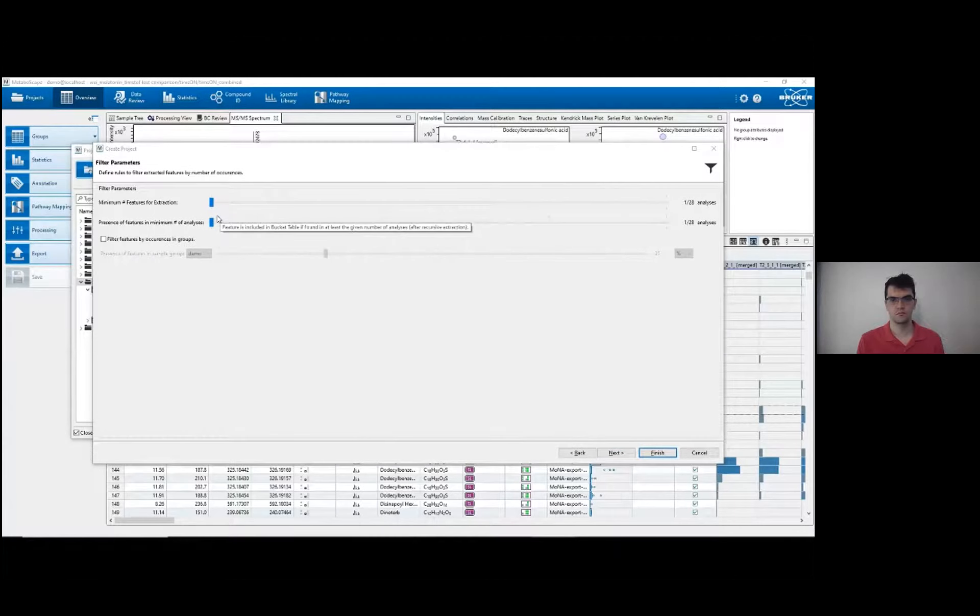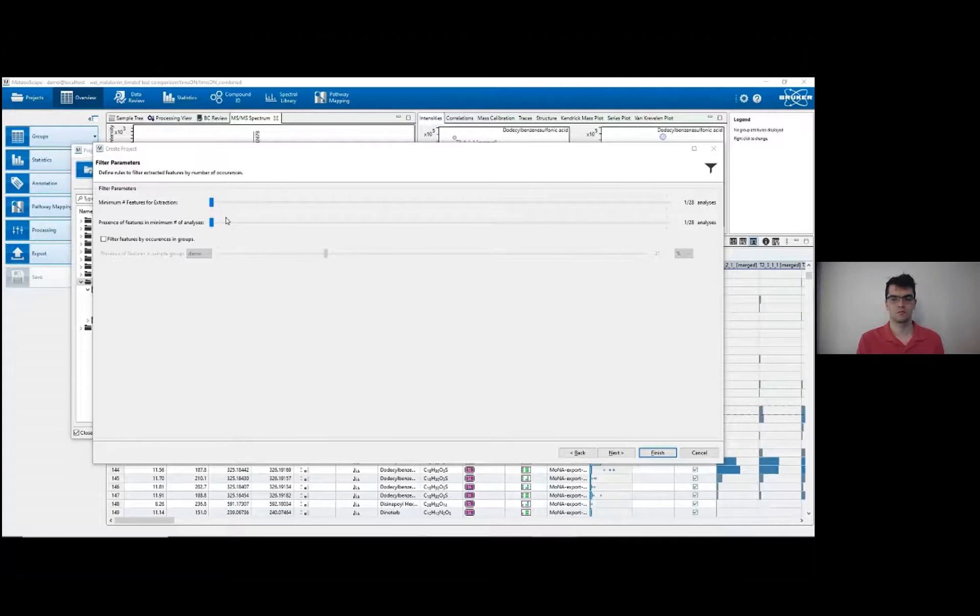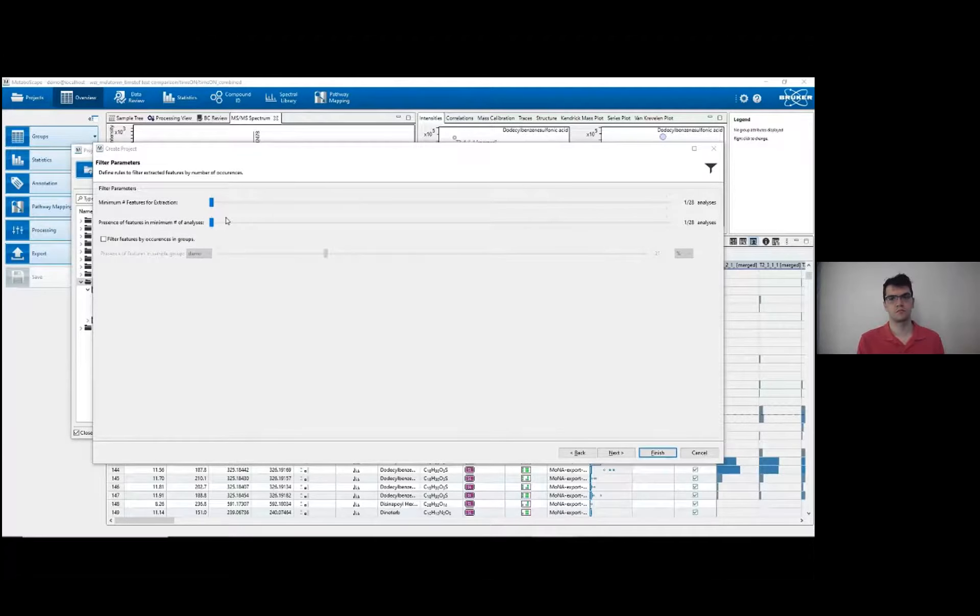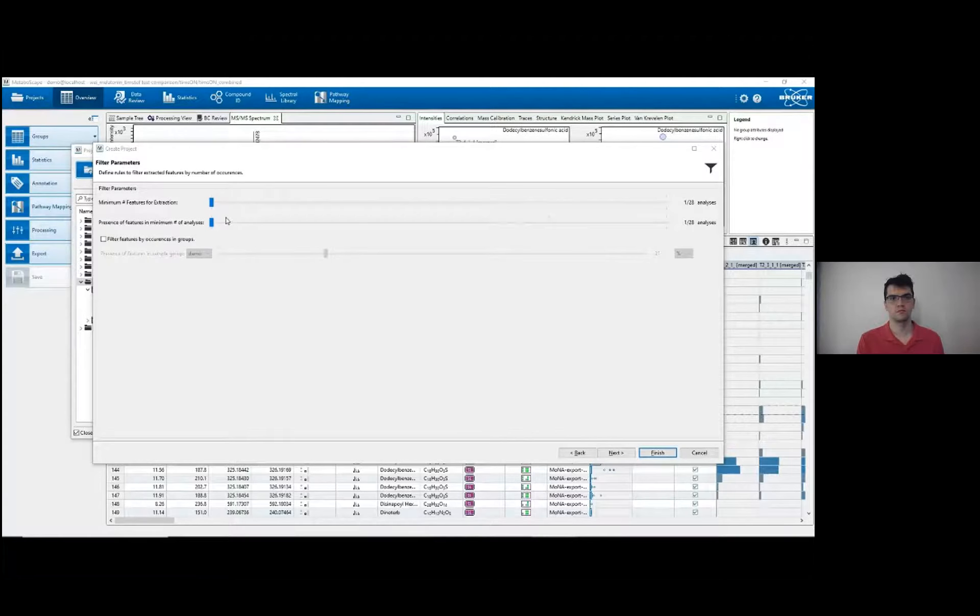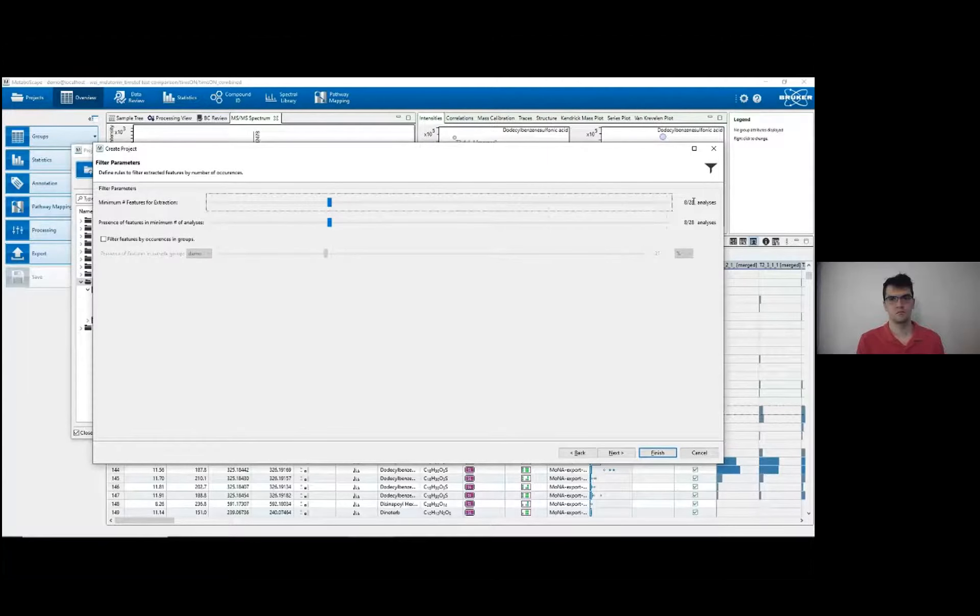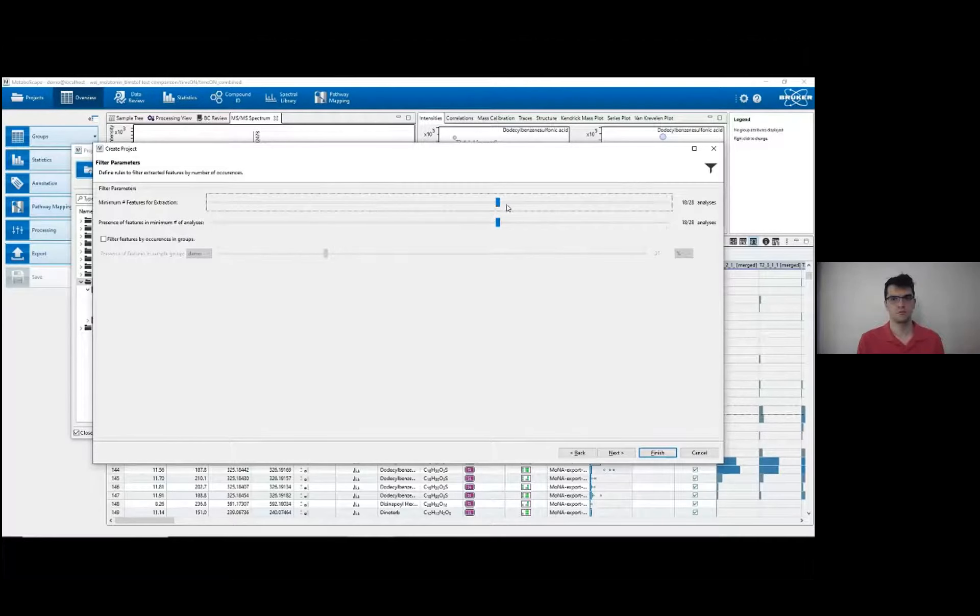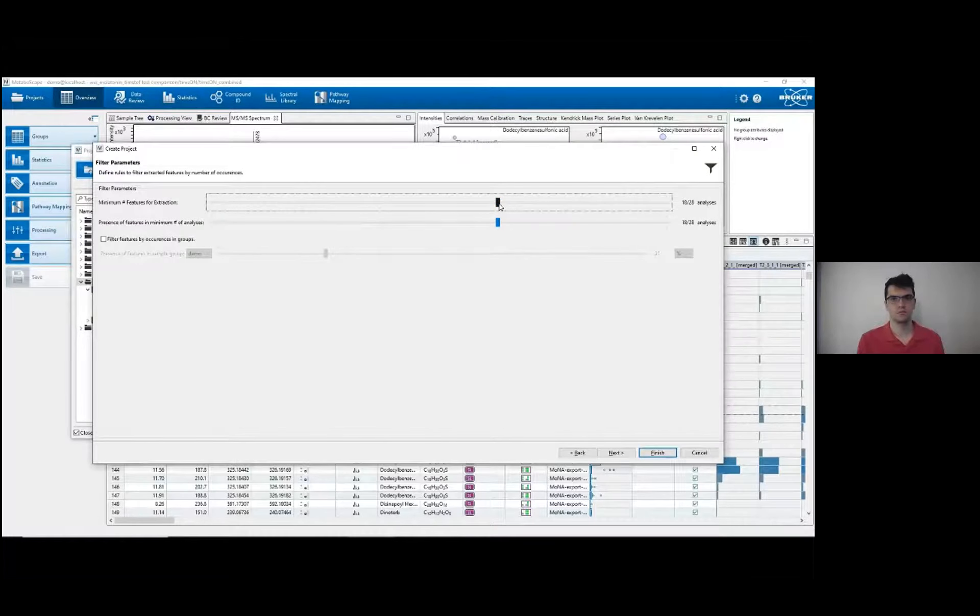These are the first of several different parameters that are used in the identification and peak association steps. These two parameters set the minimum number of times a feature must be found in different analyses for that feature to be included in the bucket table. I usually like to set this to about a quarter of the number of analyses present. If I increase this, it will be more stringent, picking up better features, but likely less of them.